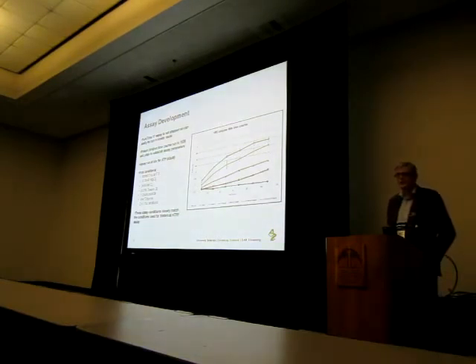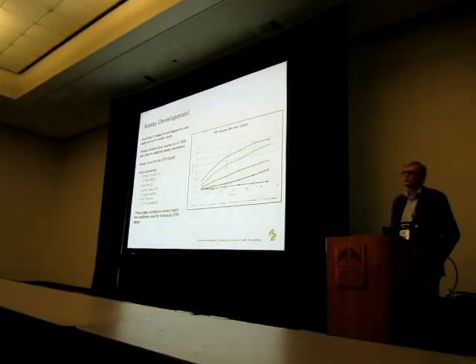As I hope I said earlier, but I can't frankly remember, because it's a kinetic assay, this type of experiment is really easy to do. You set the wells up and you just read the plate every 5 or 10 minutes. So from an assay development perspective, that's really nice. The other type of thing we would like to do with this assay would be washout type experiments where we look at on rates and off rates. Again, because it's kinetic, it lends itself very nicely to that.